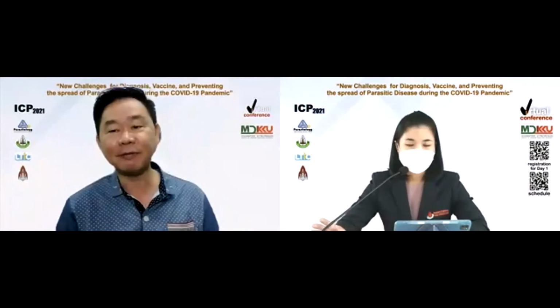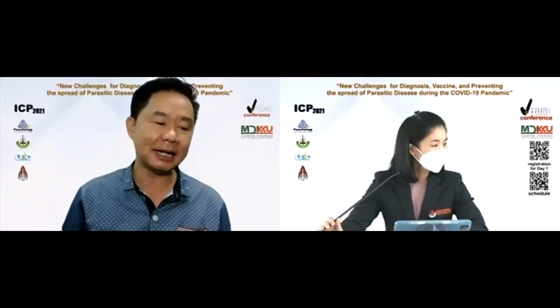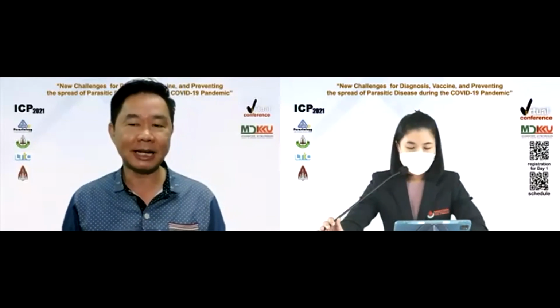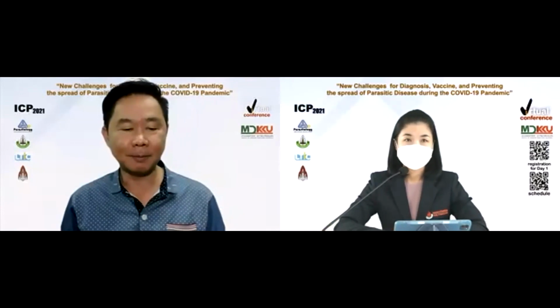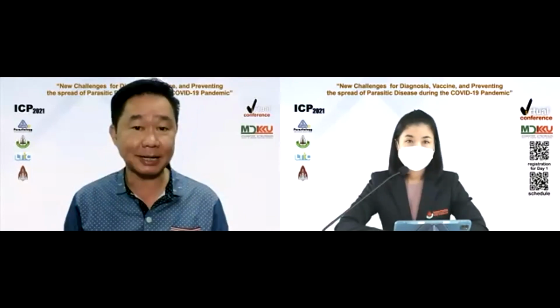We found the same thing. As you may remember, one function of tetraspanin is formation of the tegument. We showed that knockout of tetraspanin using RNAi made the worm tegument deformed. We found the same thing using CRISPR-Cas9.